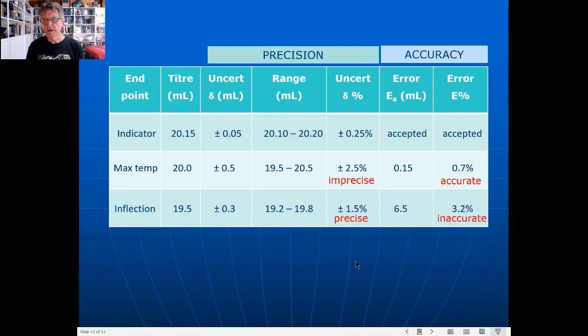Now you can see for students they're able to draw some conclusions about the quality of the experiment, the results and so on, and use all their percent errors and percent uncertainties to justify their statements. So I think that works really well.